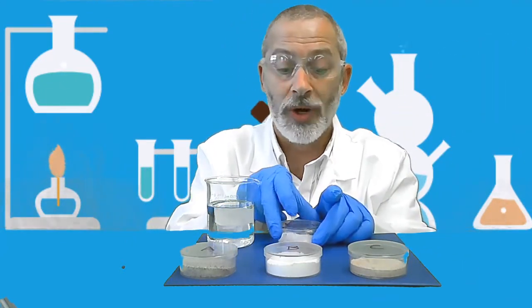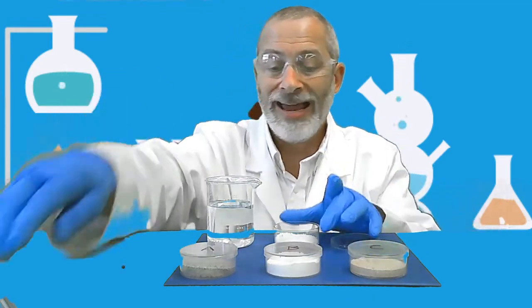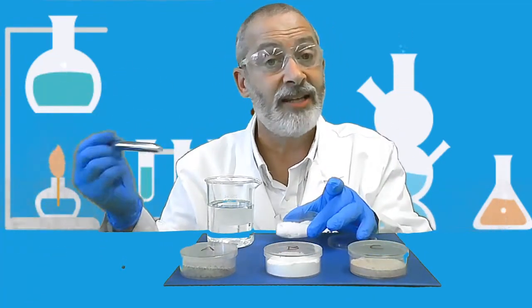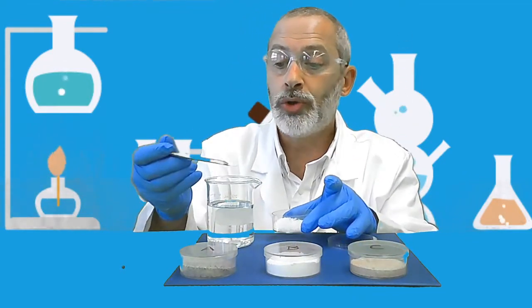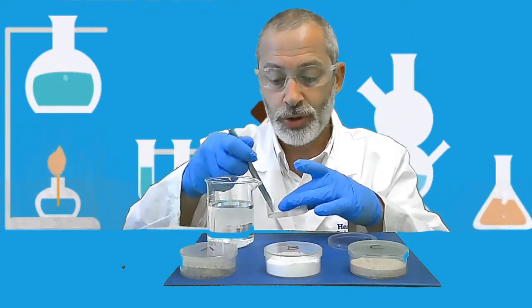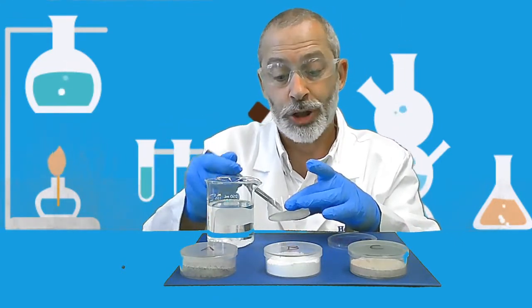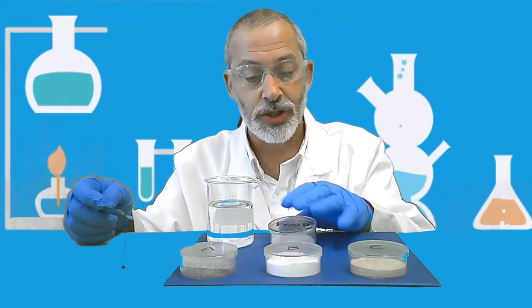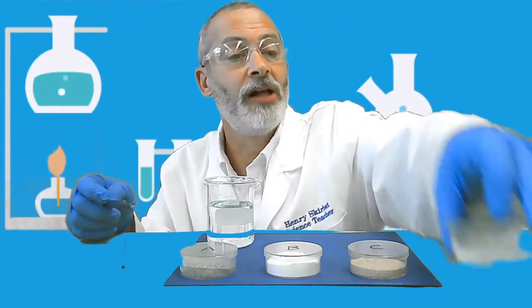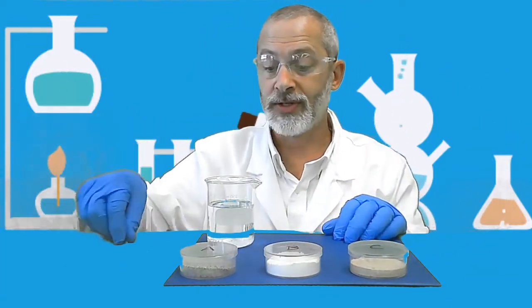We're actually going to use what NASA provided for us and labeled it food, and it is nothing more than a type of sugar. And I'm going to add this glucose into our water, which is at an appropriate temperature. And they gave me specifications of how much to add, so I'm following NASA's instructions as well as the instructions in our lab.